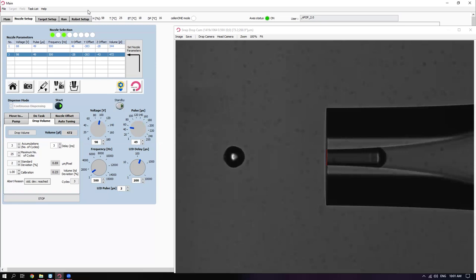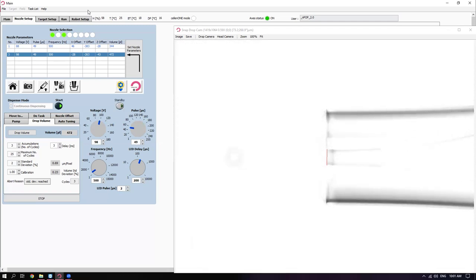So I've been working with Nikolai's group for I think 5 or 6 years now. We developed the nPOP protocol together. My background is in chemical engineering, and so small volumes, heat transfer, mass transfer, surface chemistry are things that I was familiar with coming in. Of course, Nikolai comes in with all of his understanding of mass spec and workflow development. And so it was a really nice collaboration where we were able to automate a lot of this. I don't know how many of you have seen the original protocols.io that Andrew put together, a few of you.